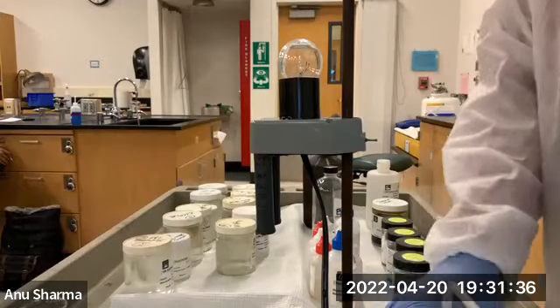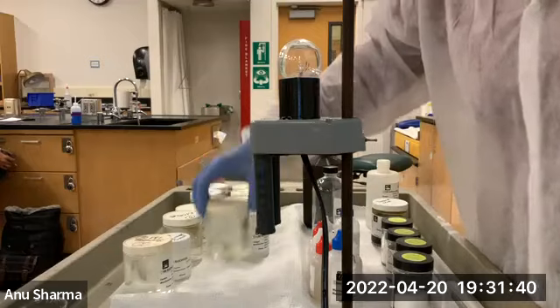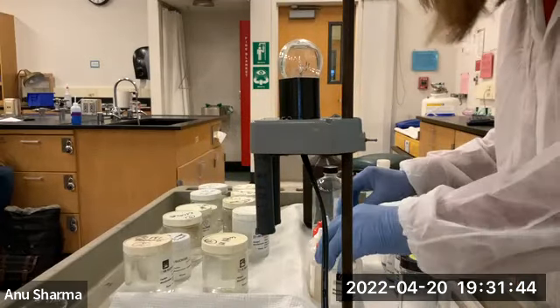All right. Here we have the sulfuric acid and barium hydroxide. So we talked about barium hydroxide.